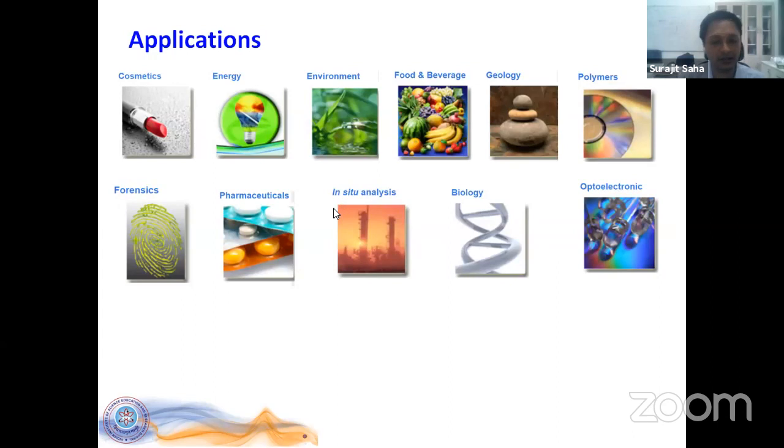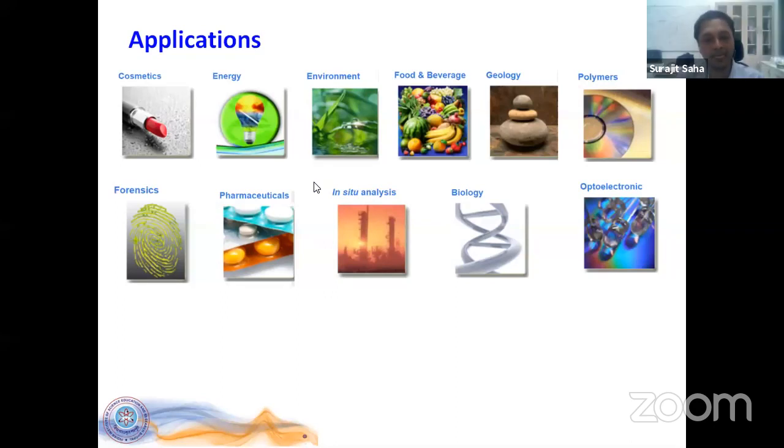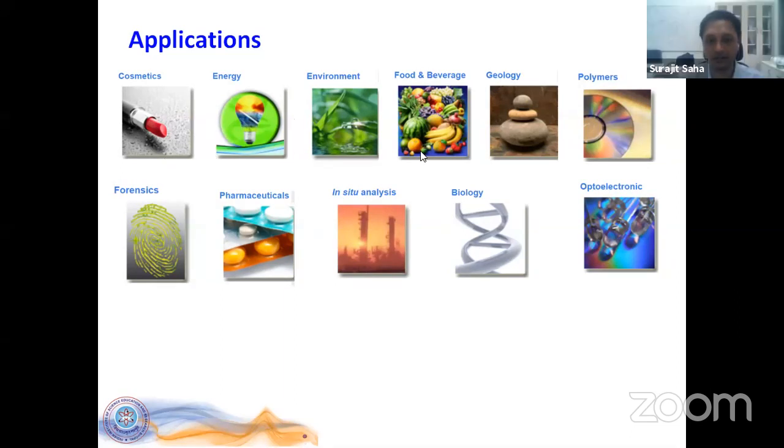Now, to speak about the applications, as I said, the fingerprint is an important aspect, and so is the sensitivity to any environment or perturbation. Because of that, Raman spectroscopy has been applied in various sectors. Name it: cosmetics, energy, food, beverages, even forensic science, pharmaceuticals. There are biology and, of course, chemistry. All these sectors have seen applications of Raman spectroscopy.